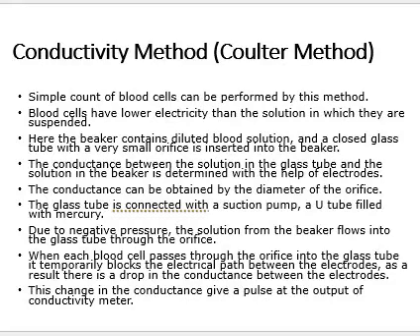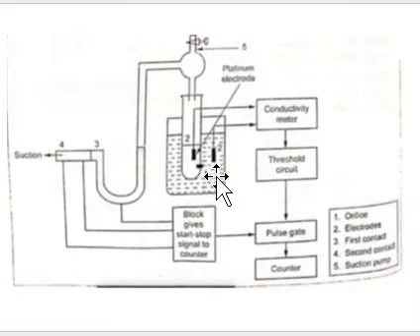Let me show the apparatus in the next slide so that we can understand clearly. Here you can see these are the 2 electrodes, and the electrodes are given supply from the source, that is a DC source, and there is a small hole. There will be a threshold pressure over here, similar to a suction pressure. There will be a small hole here.